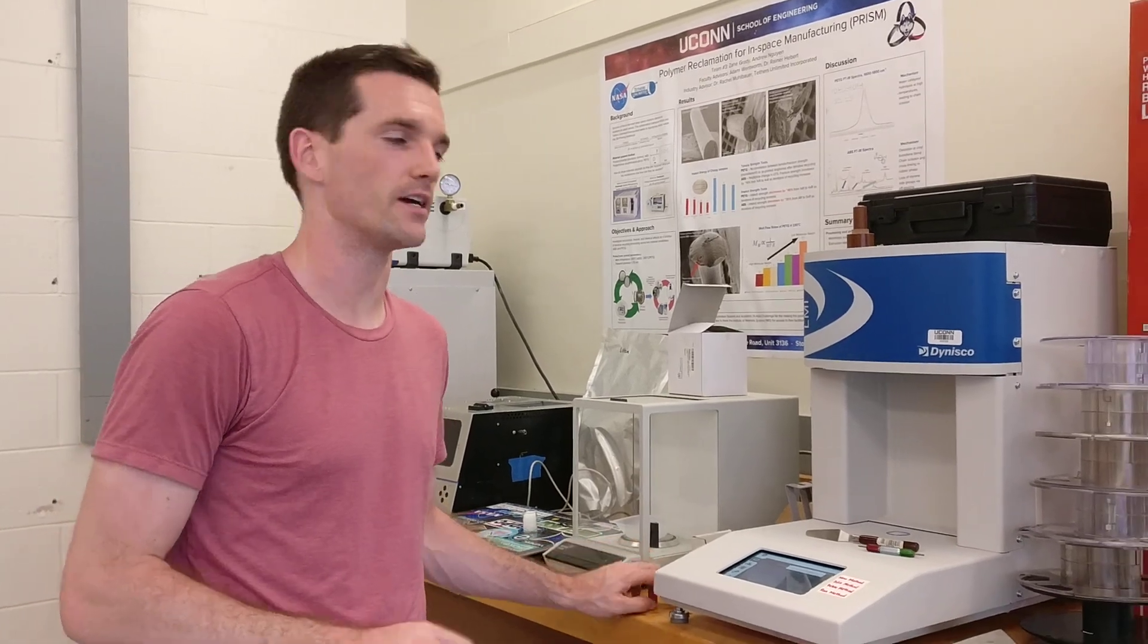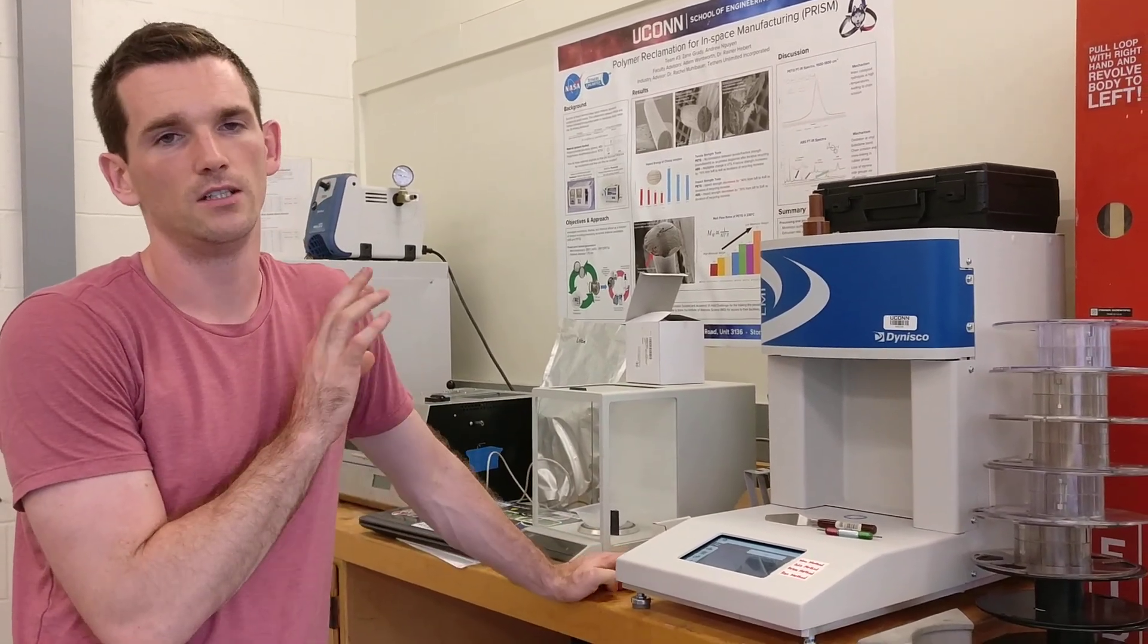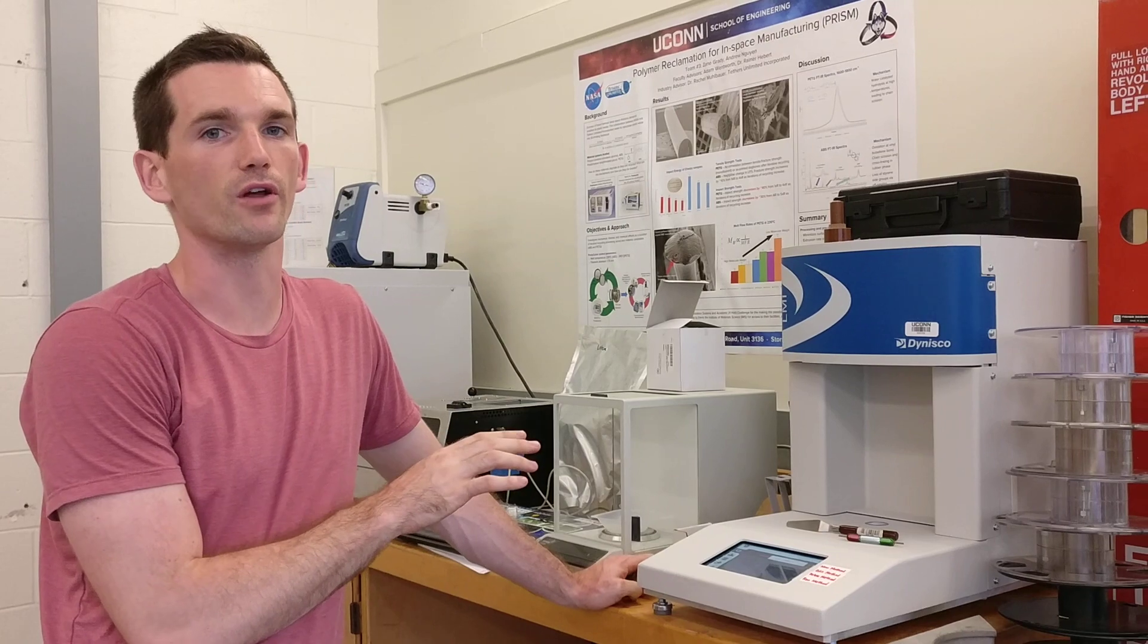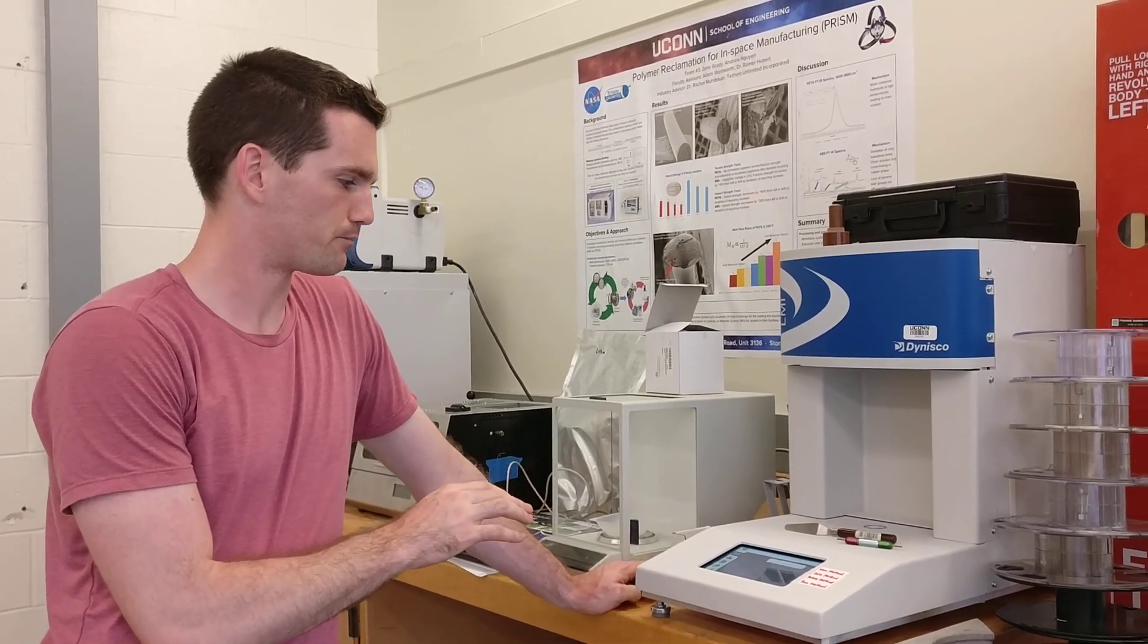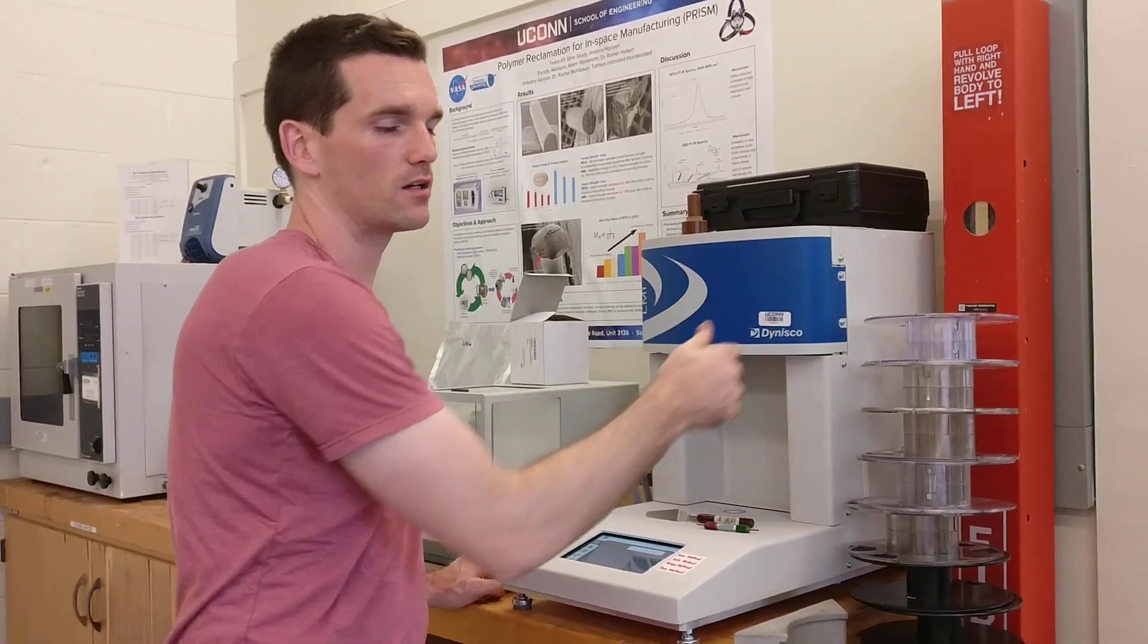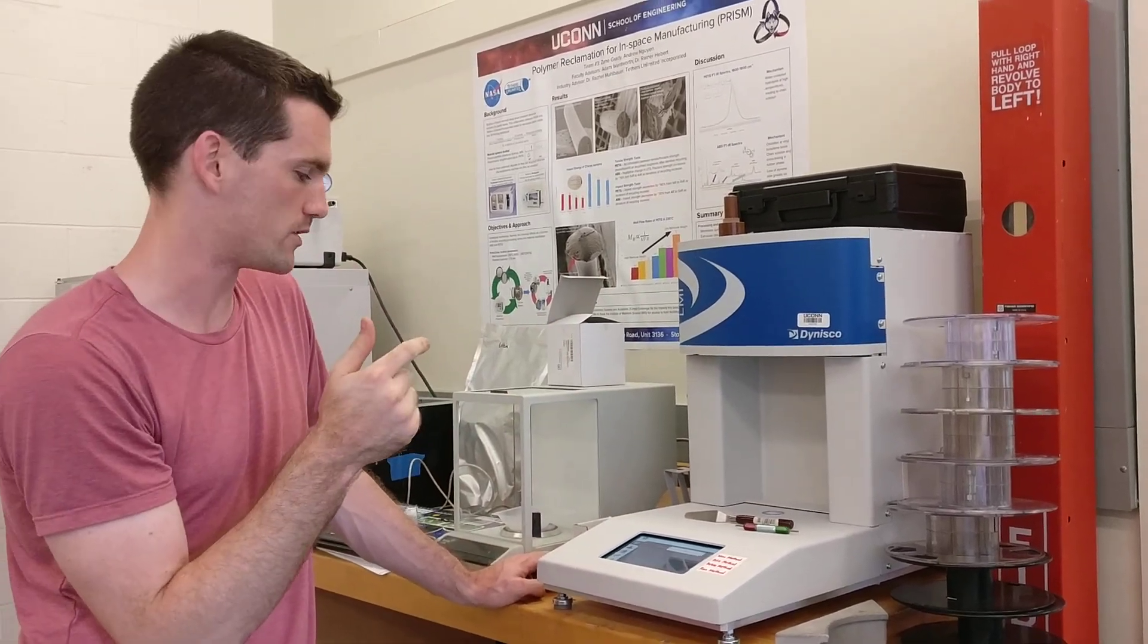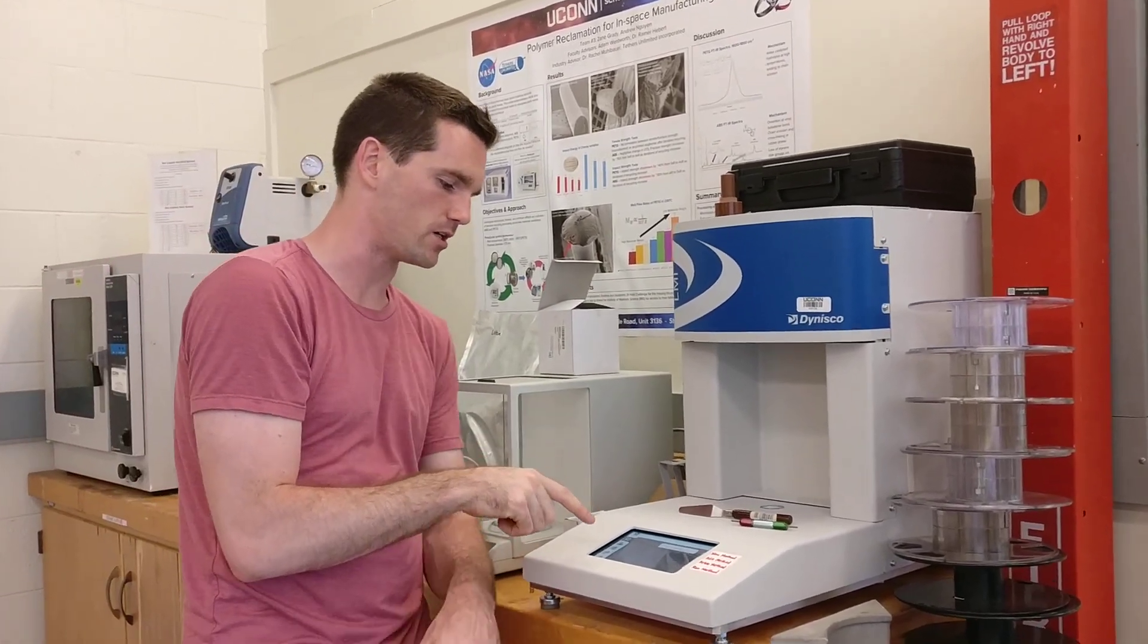This is the instructional video on how to use the Dynisco LMI 5000 melt flow indexer. The power switch is in the back, so reach around, turn that on, and then you'll see the screen right here.